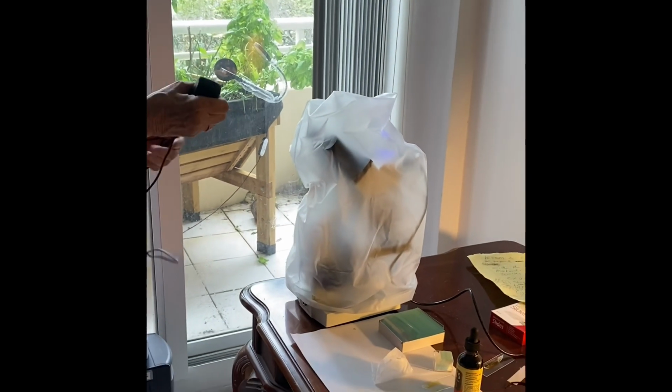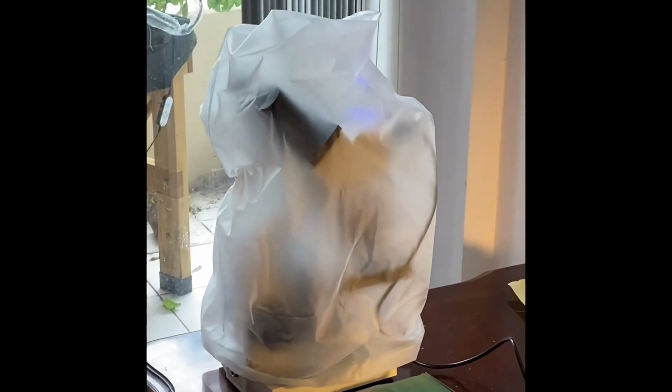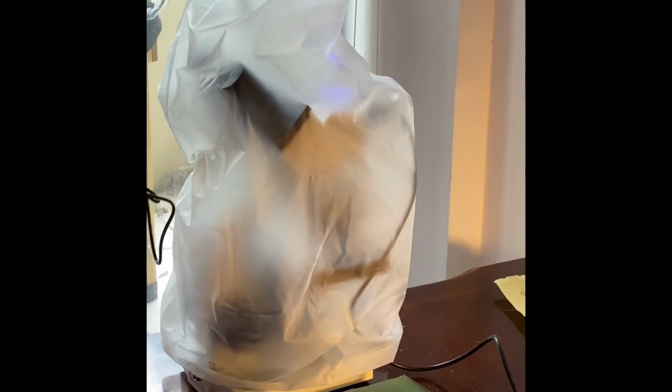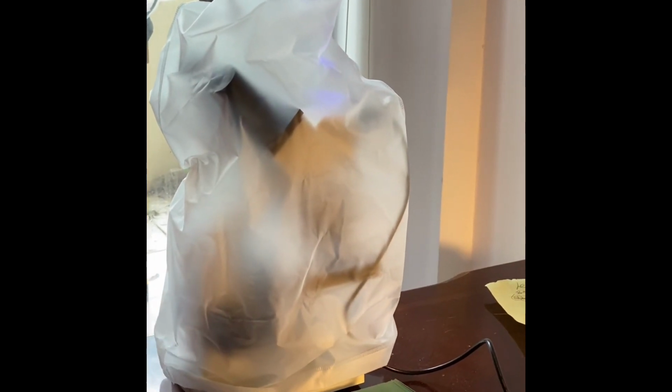In this case, my plug is not attached to the microscope. I have to wrap it by itself. Now, if it's attached to the microscope in your case, what you do is wrap it around the base of the microscope.